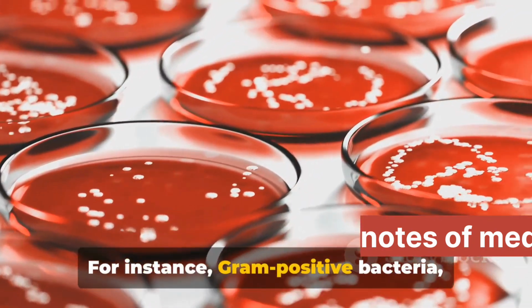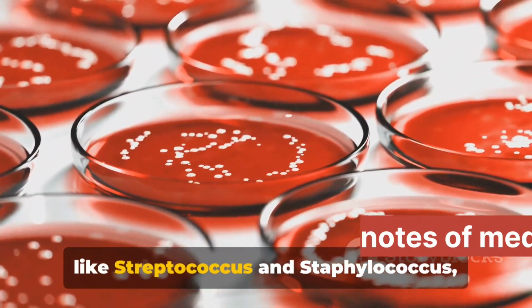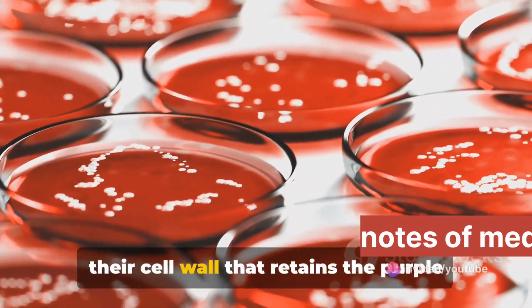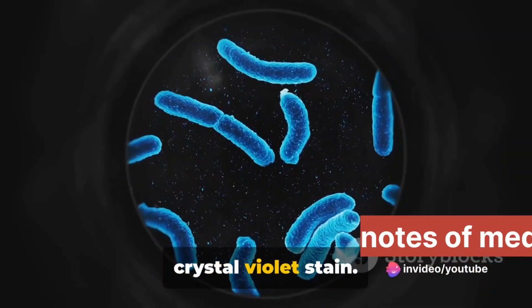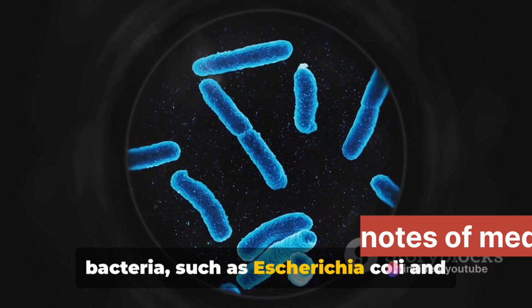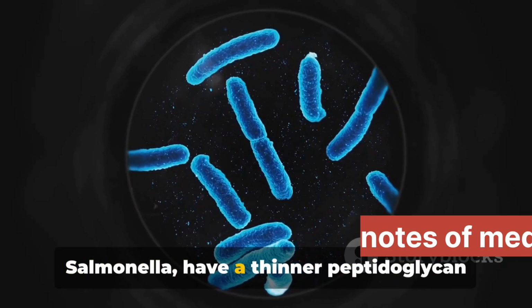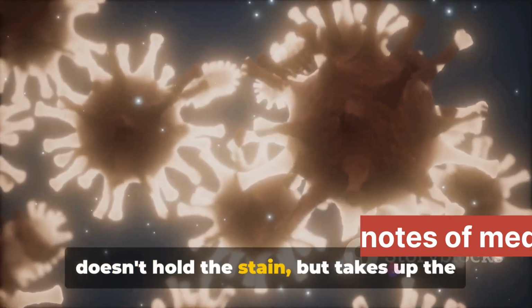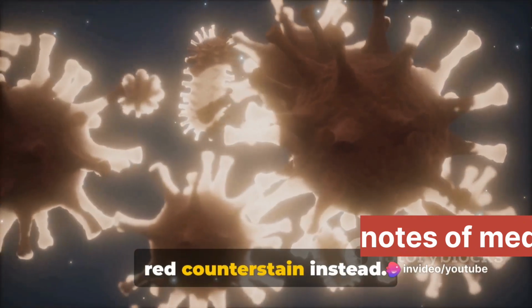For instance, gram-positive bacteria, like Streptococcus and Staphylococcus, have a thick layer of peptidoglycan in their cell wall that retains the purple crystal violet stain. On the other hand, gram-negative bacteria, such as Escherichia coli and Salmonella, have a thinner peptidoglycan layer and a lipid-rich outer membrane that doesn't hold the stain, but takes up the red counterstain instead.